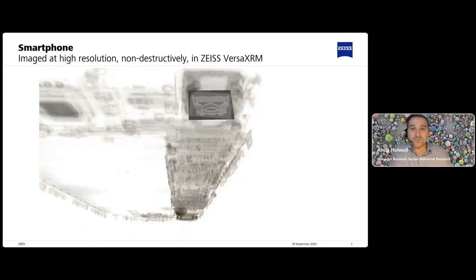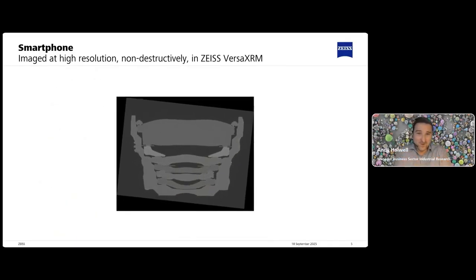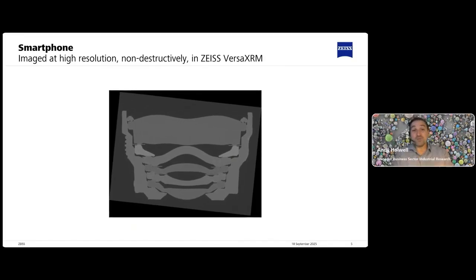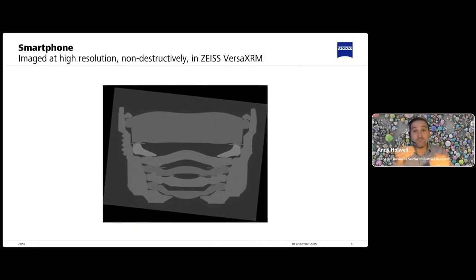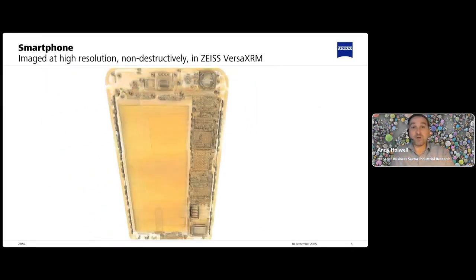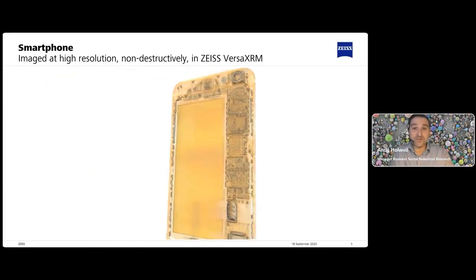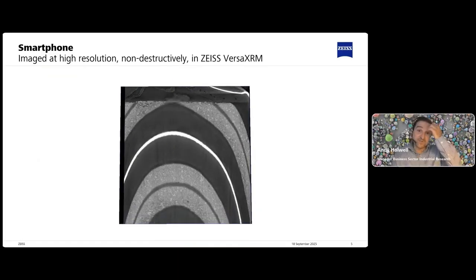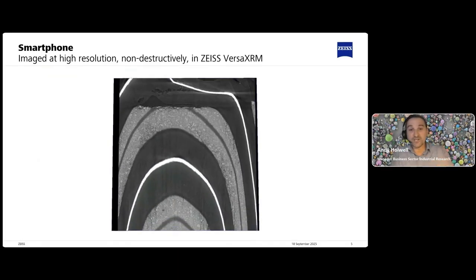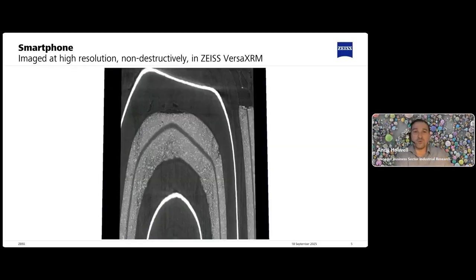We're about to zoom into the camera module. So you saw this image on the last slide. In fact, you can see how these camera modules are actually really complex and not dissimilar to objectives in microscopes. You can see they're an assembly of multiple lenses, but also materials and packaging. And of course, the battery as well, you can non-destructively image the battery itself. Here we go. So here we have the individual cathode, anode, and separator layers. And you can see the individual cathode grains, and you can even see some of the cracks and porosity non-destructively.